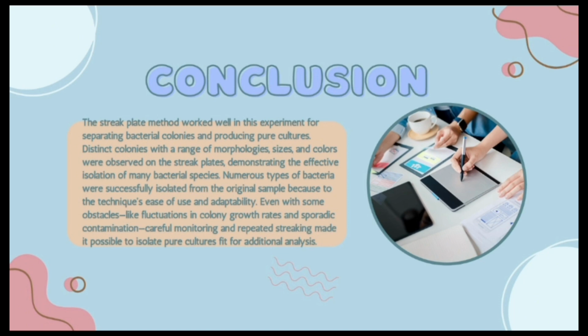even with some obstacles like fluctuation in colony growth rate and sporadic contamination. Carefully monitoring and repeated streaking made it possible to isolate pure cultures for additional analysis.